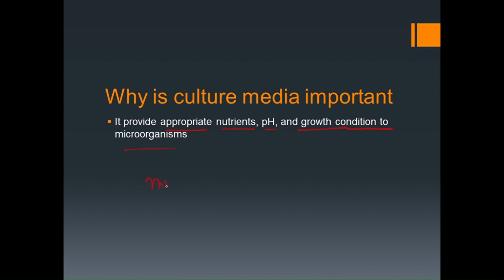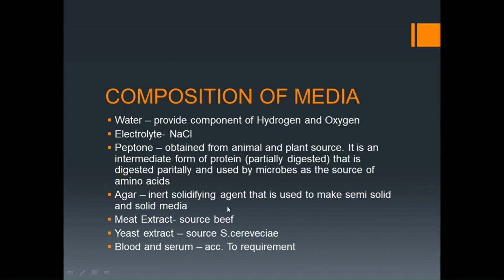As you know, in microbiology, biotechnology, and tissue culturing, we all need this culture media in order to support our specimen growth. But since here I'm going to talk mainly about microbiology, I'm going to explain everything with regard to microbiology only. So let us start with the composition of the culture media.